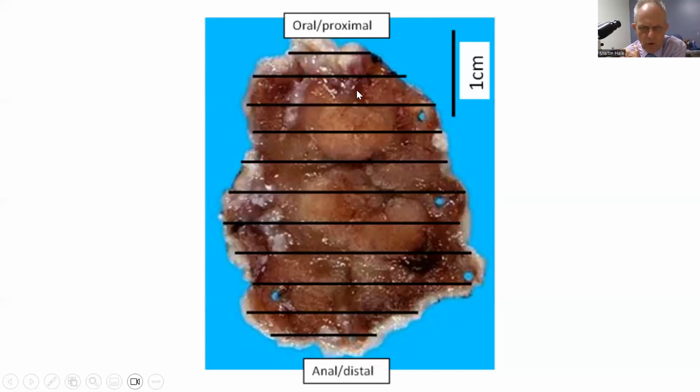So these holes represent the pins that you saw in the previous case, and notice the dimensions. We call this bread slicing or bread loafing, and the whole biopsy is put through. Now let's just put this into perspective. This is a piece of tissue that is some 4 centimeters by, say, 3 centimeters. When we take our blocks, the blocks that we take are about 2 millimeters thick. So we will take a 2 millimeter slice.